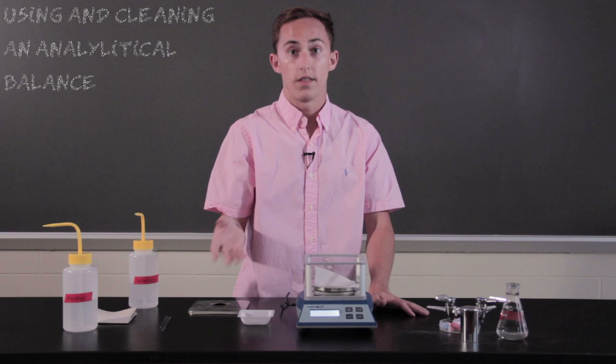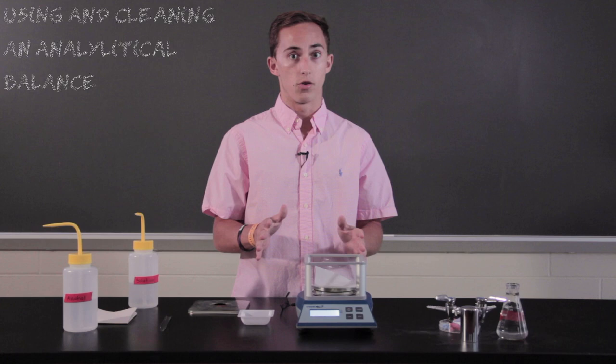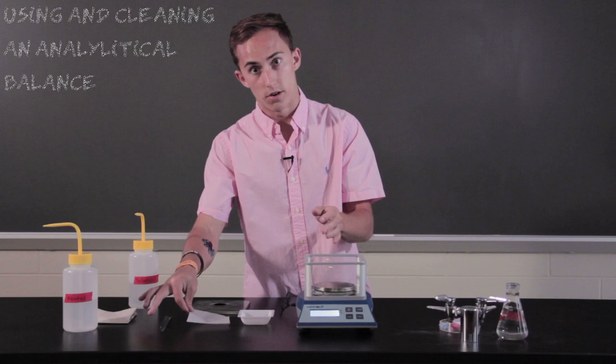You'll tare it, then you'll put your sample in. Then, you'll weigh it, and you put however much you want in, how much you need, and then it'll weigh it, and then afterwards, you just take your weigh paper out, and you can dispose of it later.